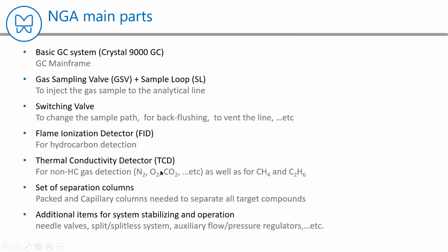TCD compares the thermal conductivity between the target compound and the carrier gas. So thermal conductivity we can use for gas detection.